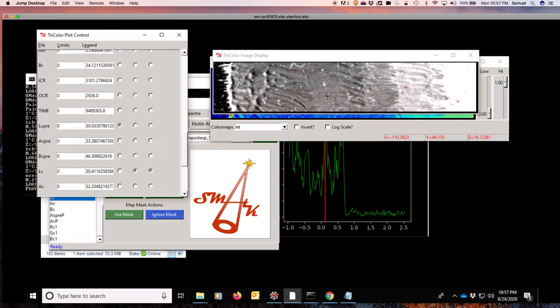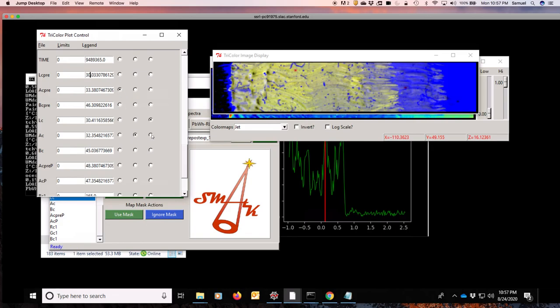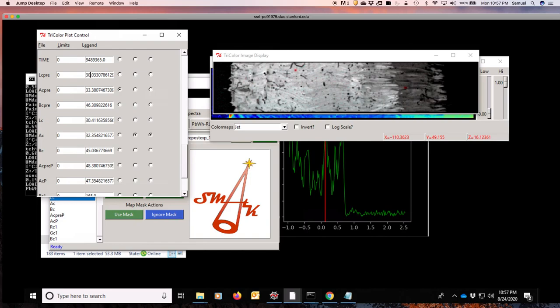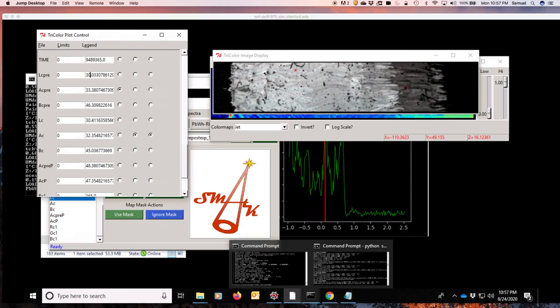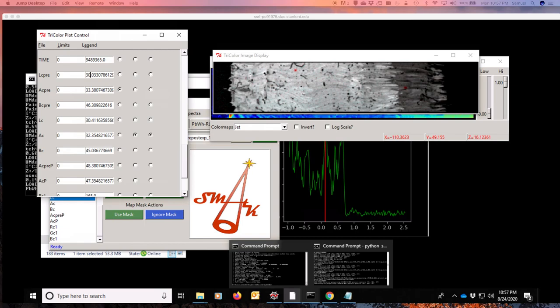And we can even compare this on the other coordinates. So if you remember the A coordinate, we can do that with the A coordinate as well, and see the same kind of changes occurring. And here again we see that the A coordinate is going to more negative positions. And the more negative positions in the A coordinate are going from reddish colors to the bluish colors. So we're doing a darkening blue-black change as we hit the sample with x-rays for long periods of time. So this is a great way to actually get quantitative information. You can also do this with several images over time and actually get the changes in the color coordinates. And when we have this with our actual XAS spectra, we can quantify this with each pixel in the actual spectra and see what is changing.